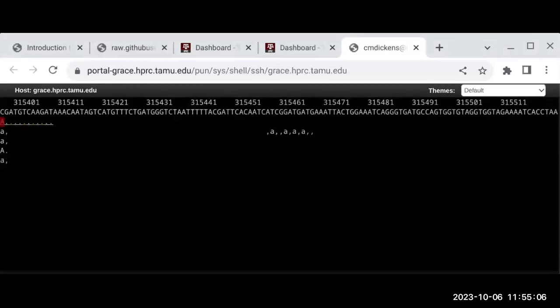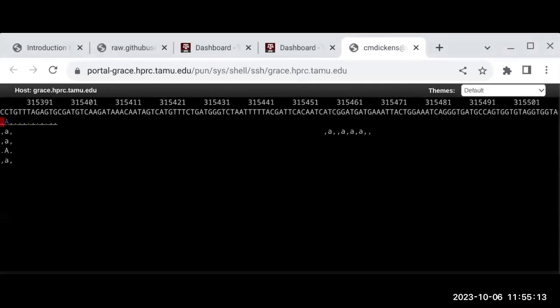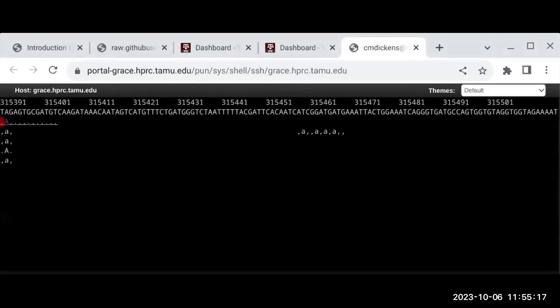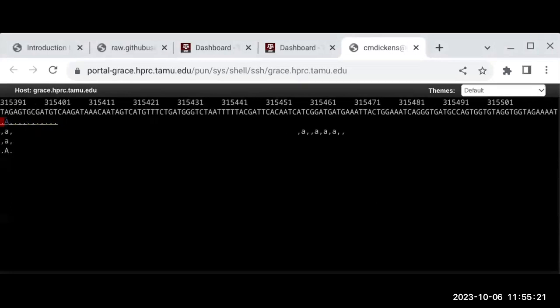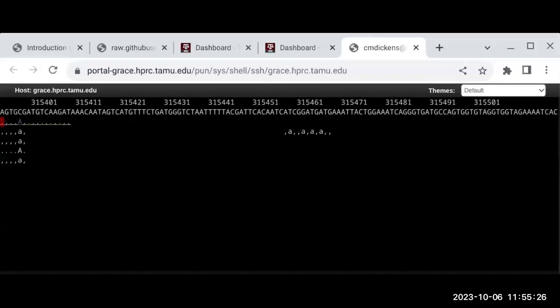All right, now you can see how samtools tview shows you where the SNP is. And I'm going to hit the left arrow just to bring it over here. Oh, this is not good. It went too far, it missed. Looking at this through the browser's not good. See, notice how it shifts over. It shouldn't do that. So you'll have better luck with this on the command line.